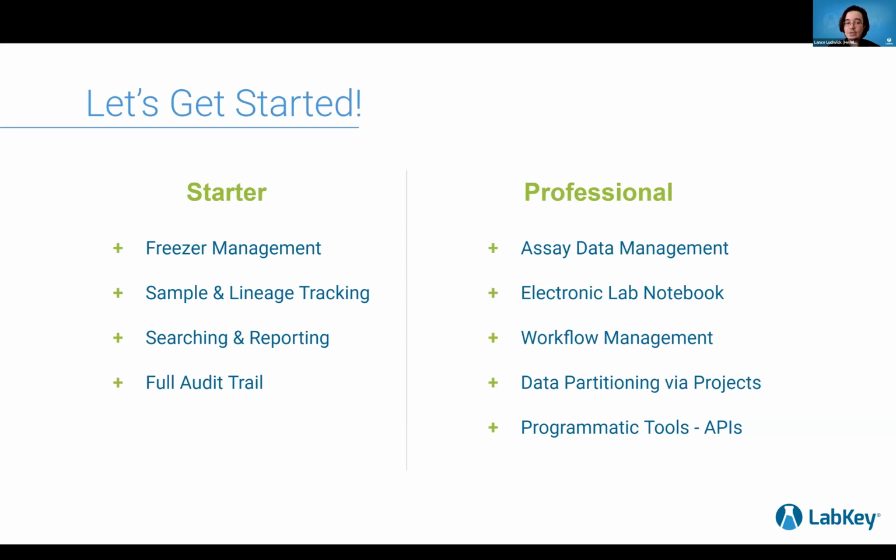So depending on what your needs are, we can help make sure you pick the right tier. And if your needs change over time, it's super easy to upgrade from starter to professional. So we're always here to grow with you. And then we also have other software that goes beyond these capabilities if you grow even more.